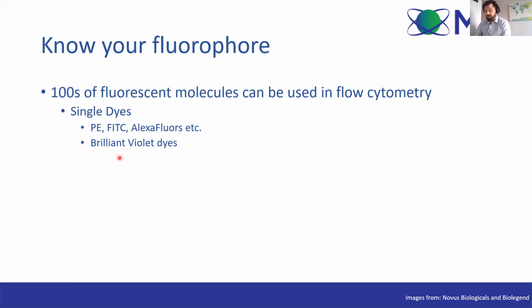The newer dyes have also been developed to take advantage of more lasers that have come on the market, like the 355 and the 405 lasers. And also in the case of the Brilliant Violets particularly, they have increased the Stokes shift, or the difference between the excitation and the emission, to give you more possibility for multiplexing. So these are very common. You'll see them all over the place.